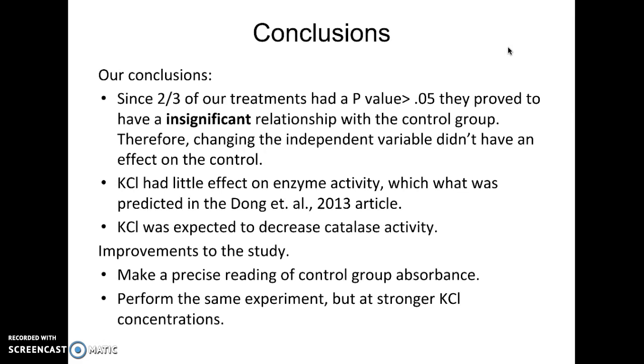If this experiment was performed again, it could be improved by making a more precise reading of the absorbance of the control group. Also, preparing the potassium chloride solution at a higher molarity could yield a more significant impact on enzyme activity.